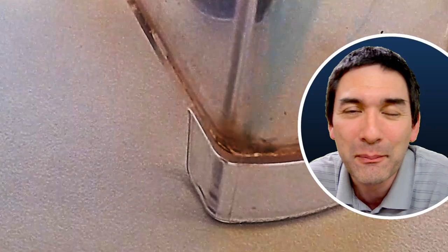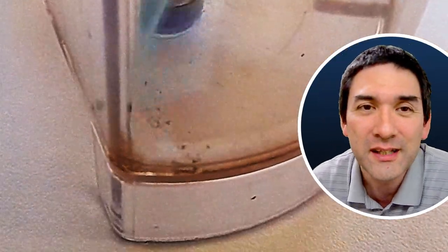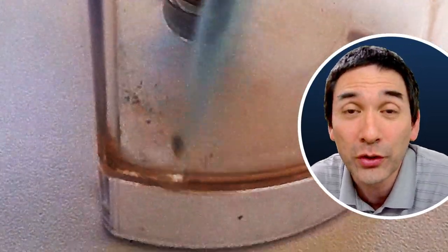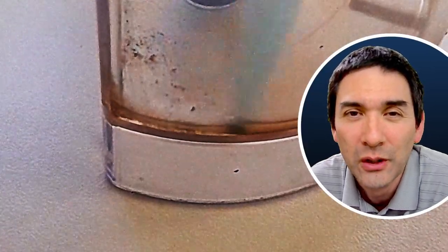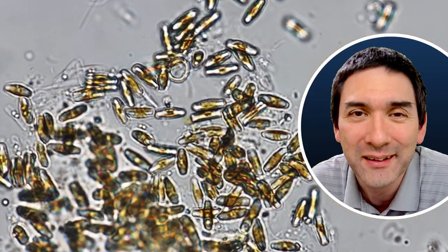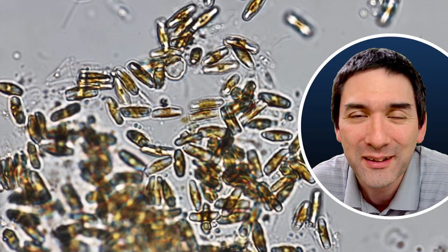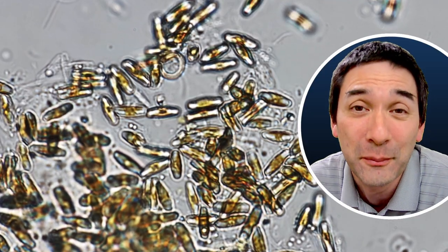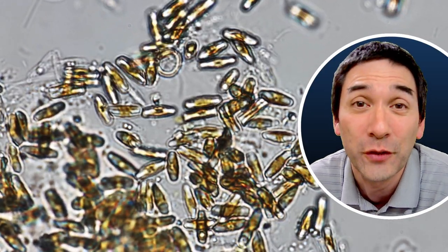That's the microbes of my coffee machine. This is the water tank, water container of my coffee machine. And I discovered that there's a biofilm growing in there. So there was a green layer of slime growing inside the plastic container. And of course, I had to put it under the microscope as well.